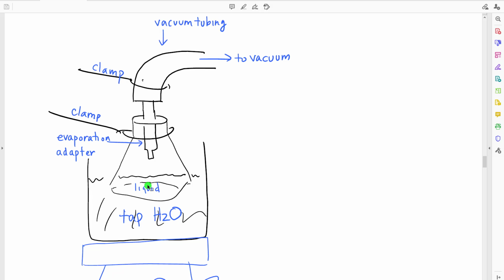So the temperature of the liquid would go down, which would reduce the rate of evaporation and even cause water to condense inside. By putting it in a larger reservoir of water, that large reservoir will have heat energy which will flow back into the liquid, replacing the heat energy lost in evaporation.